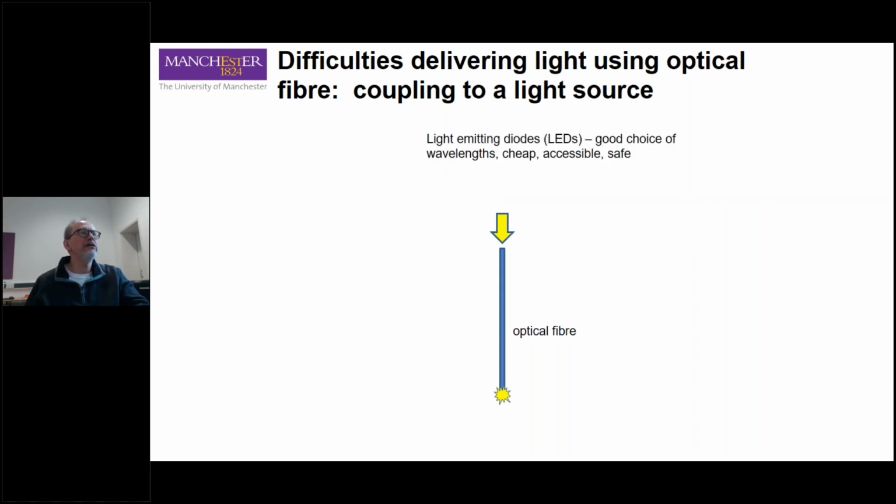So recently, LEDs emerged as a powerful and convenient source of light. However, LED emitter surfaces are generally large compared with the diameter of the optical fiber, which is usually less than 1 millimeter. And therefore, a lot of light is usually lost in this coupling. And also combining colors or different LEDs into one single thin optical fiber is neither efficient nor easy.